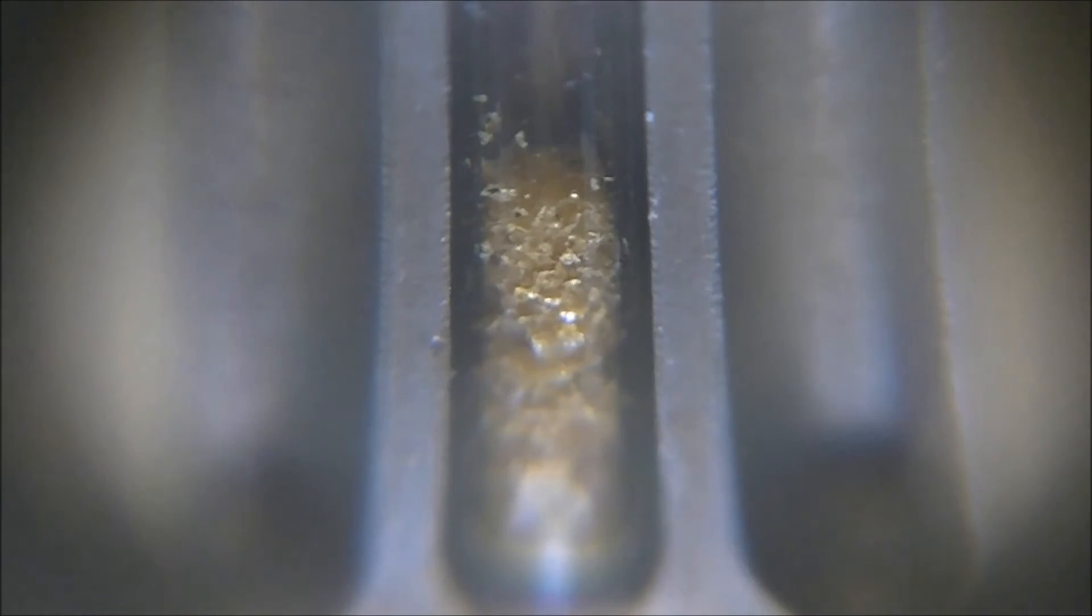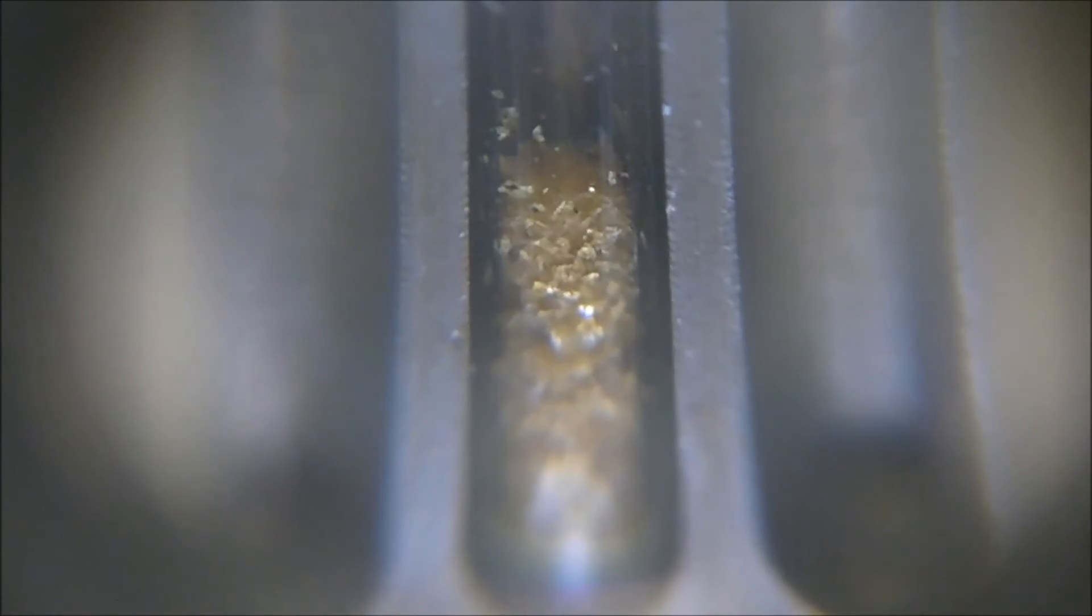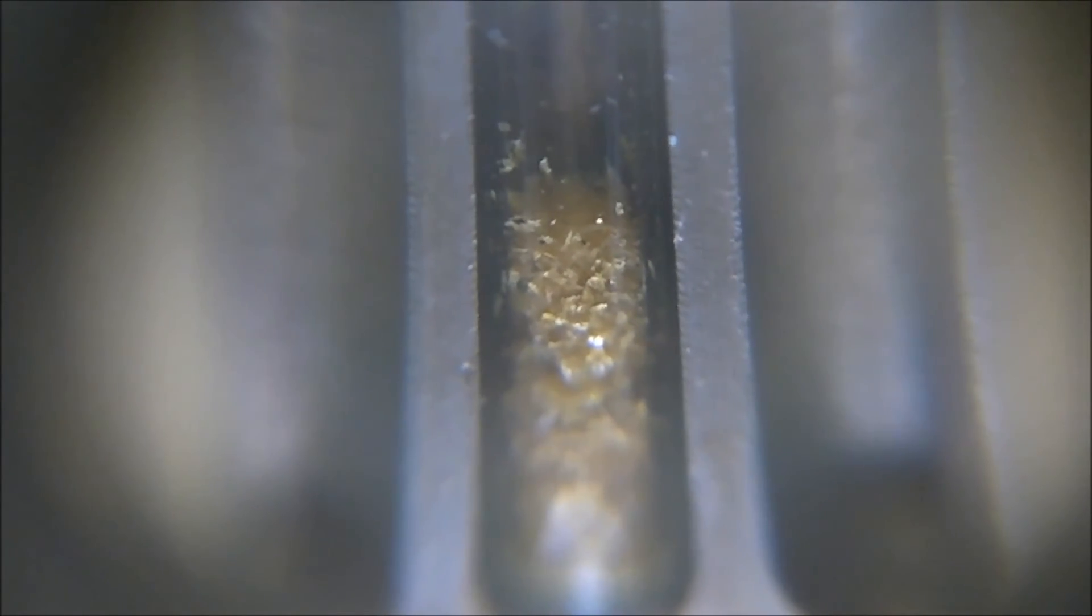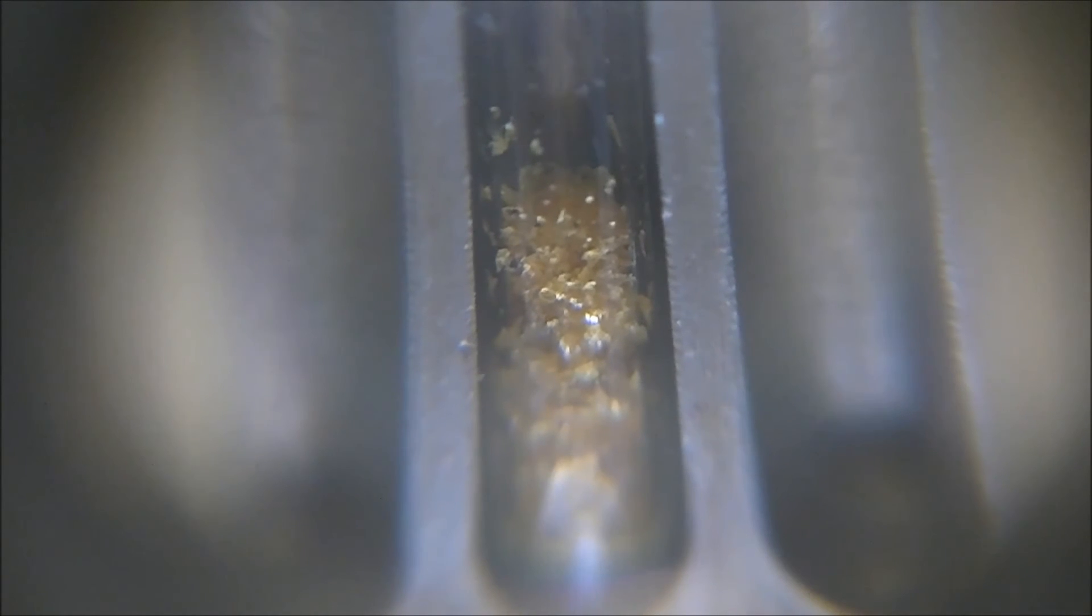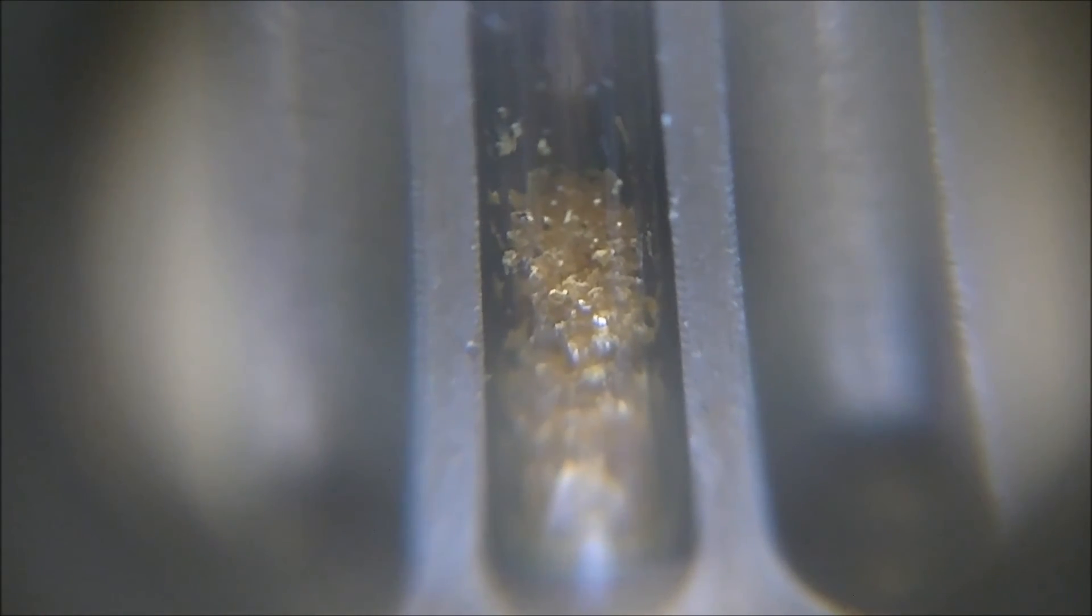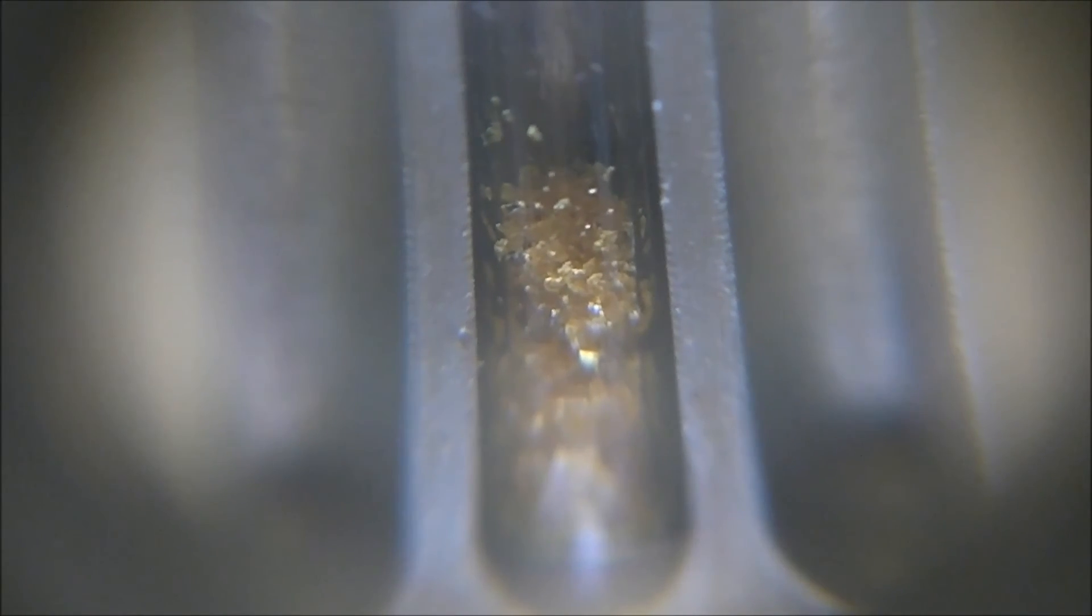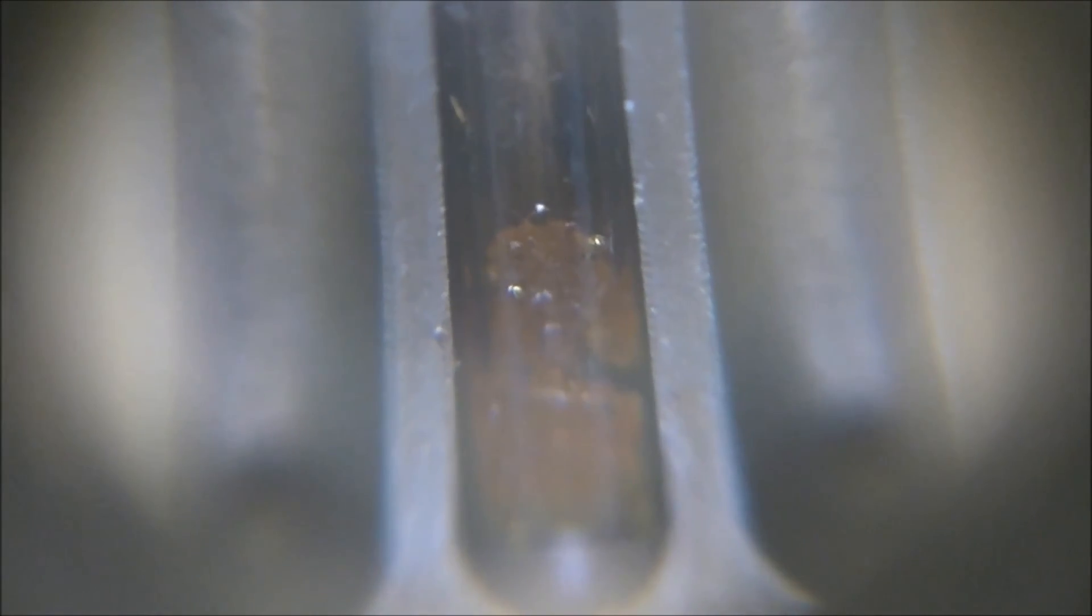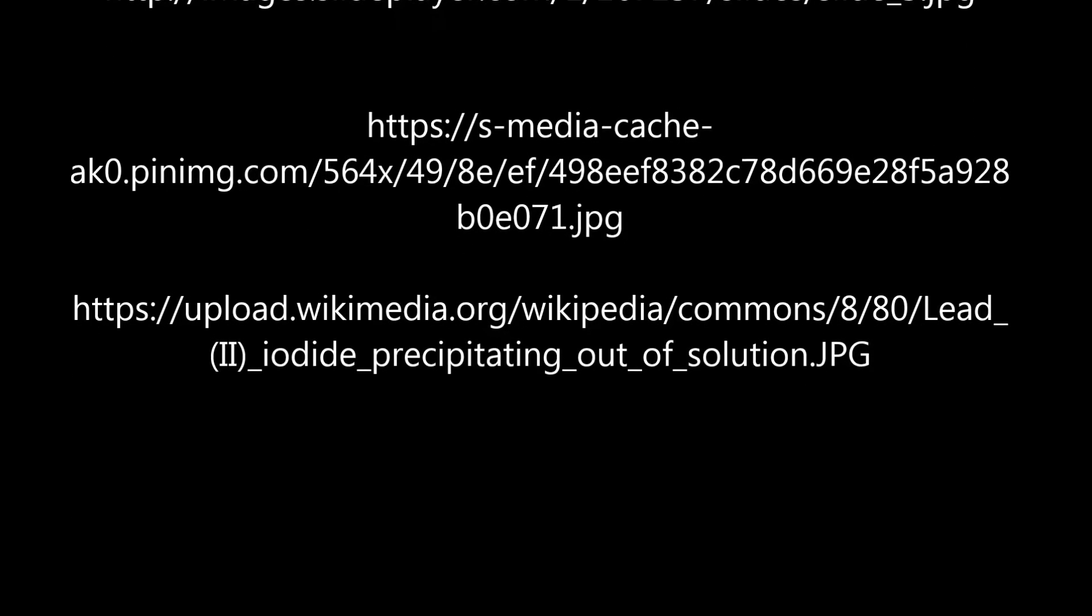This is the view when you're looking inside the digi melt. How the look of the substance changes helps you determine when to record your melting temperature. You'll need to record a range starting from the moment the substance looks wet and starts to glisten to the point when the substance is completely melted. Sometimes it's hard to tell when wet is, but you know the substance has for sure begun to melt when you start to see some movement and collapse. This is what it looks like when the substance is completely melted.